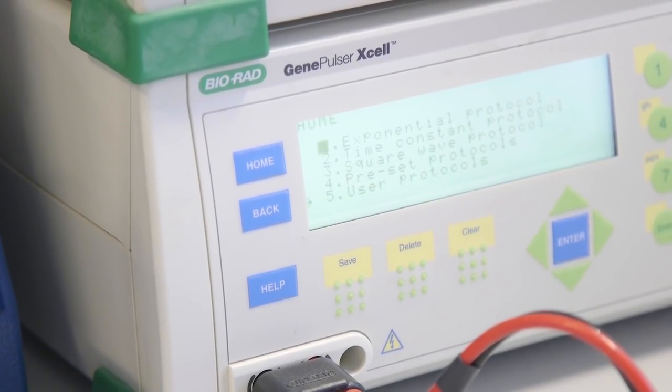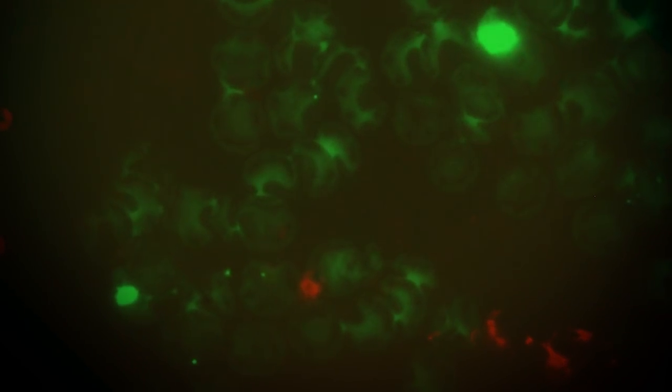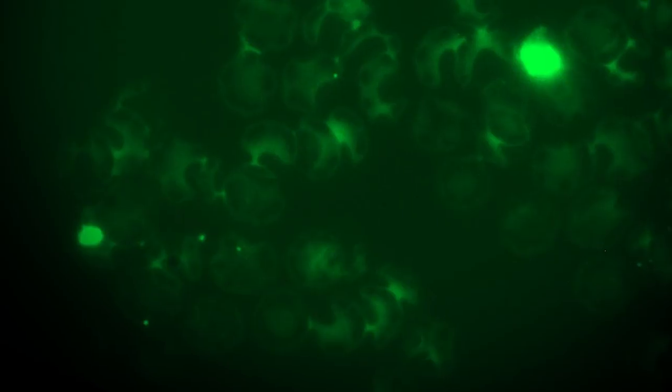We also introduce fluorescent proteins into the parasite to be able to follow it throughout the infection and assess its ability to invade particular red blood cells.